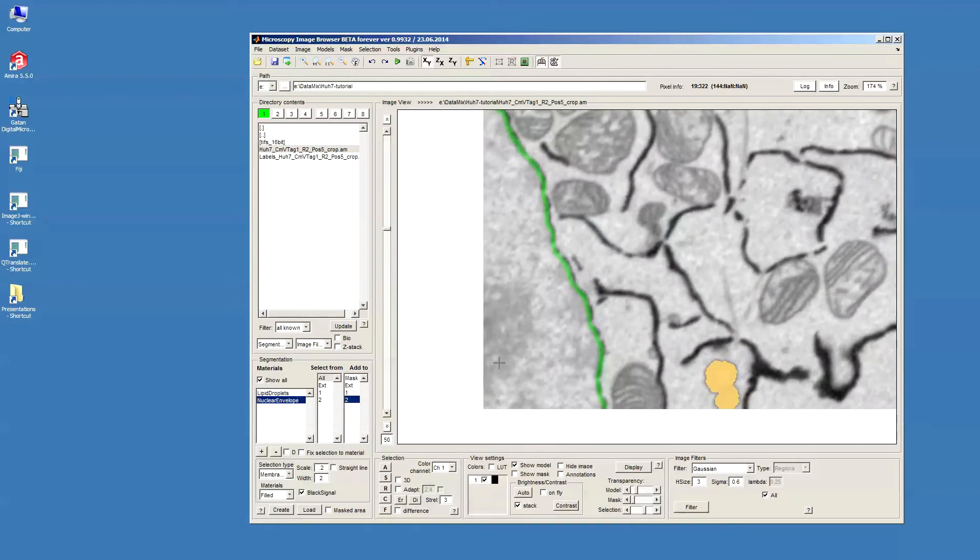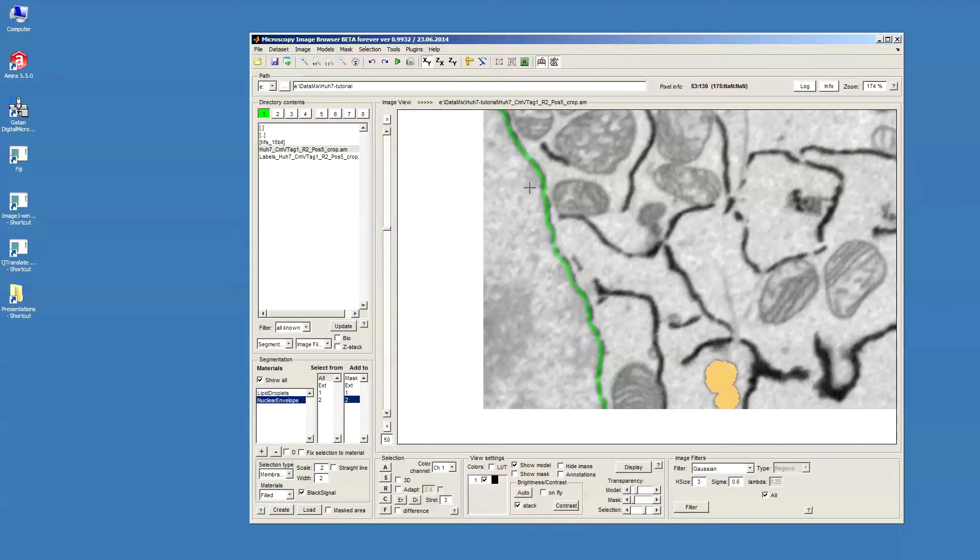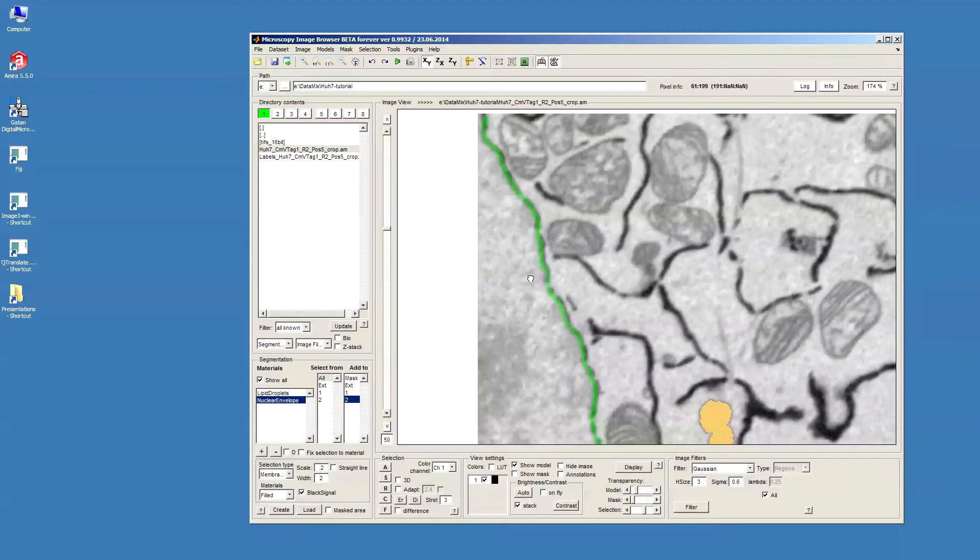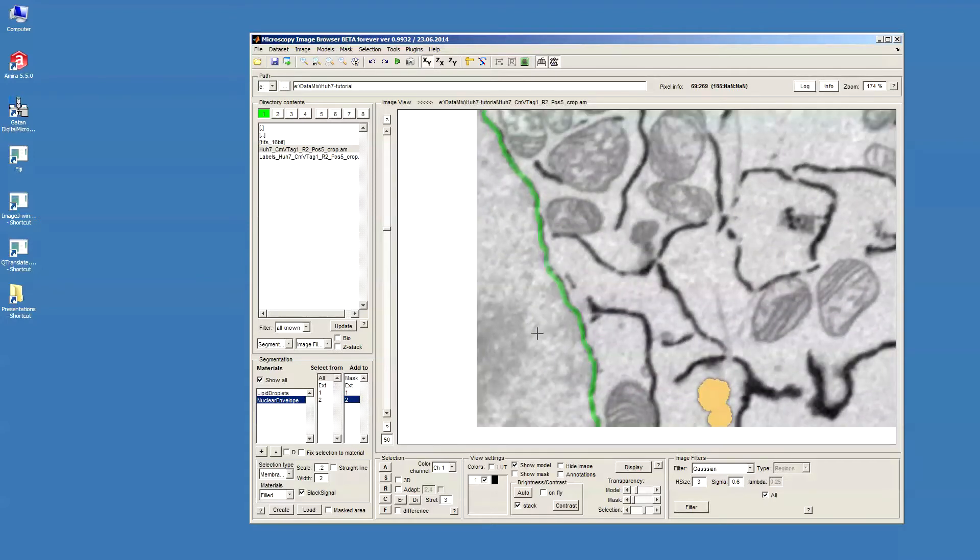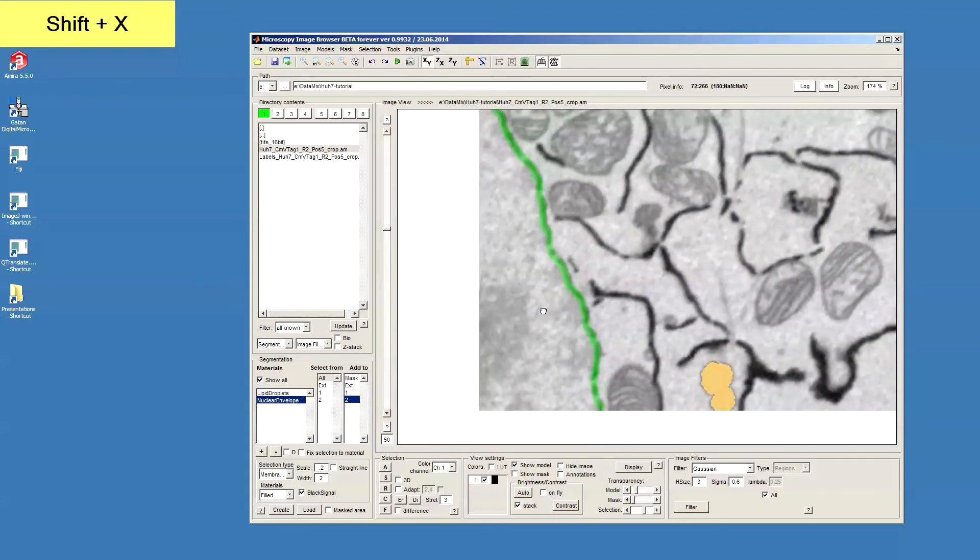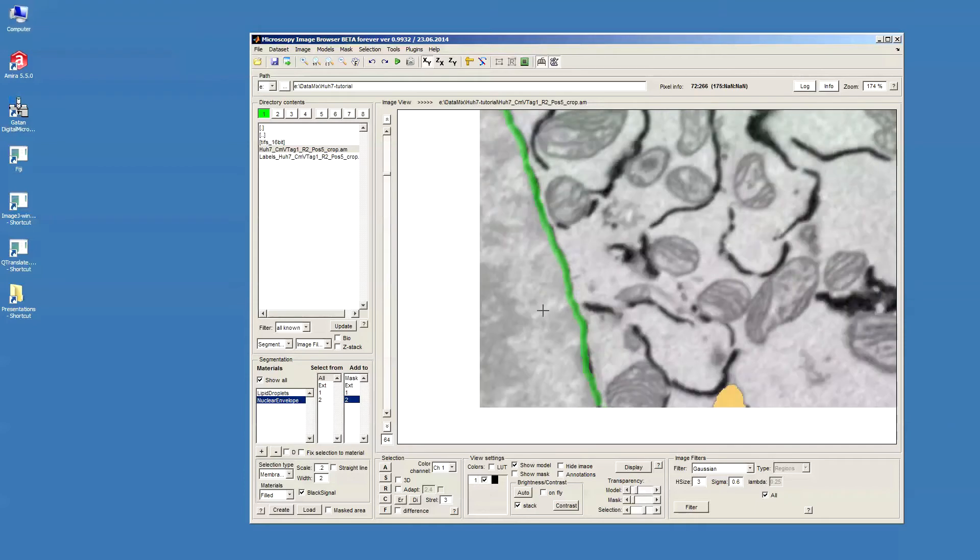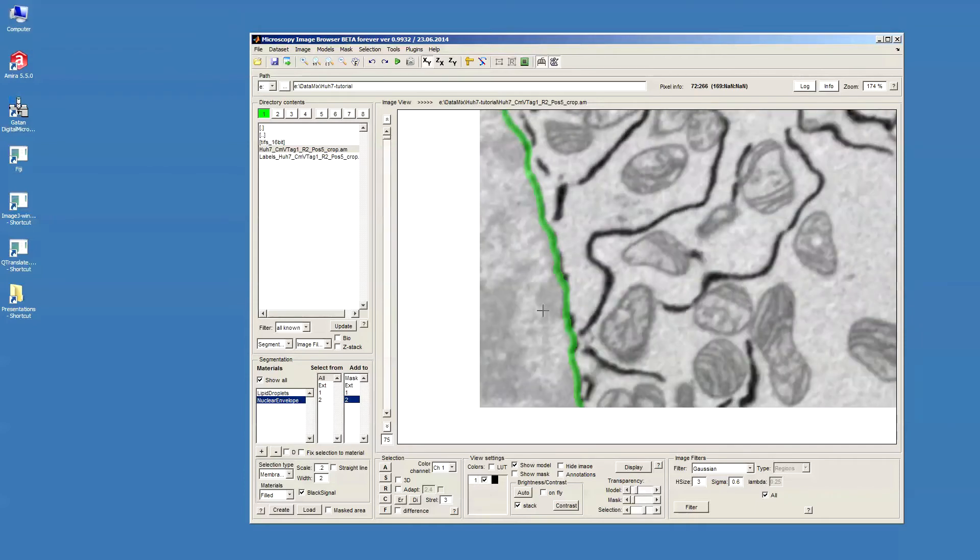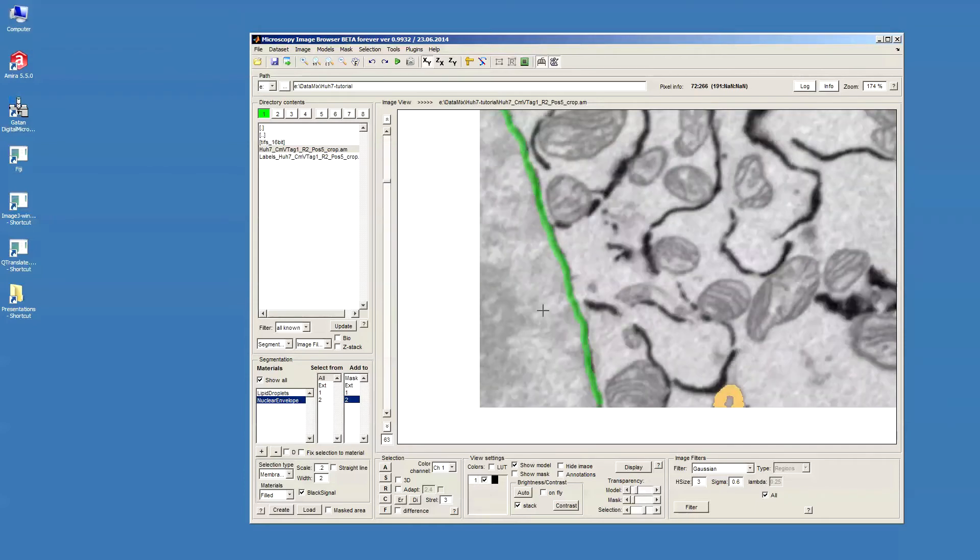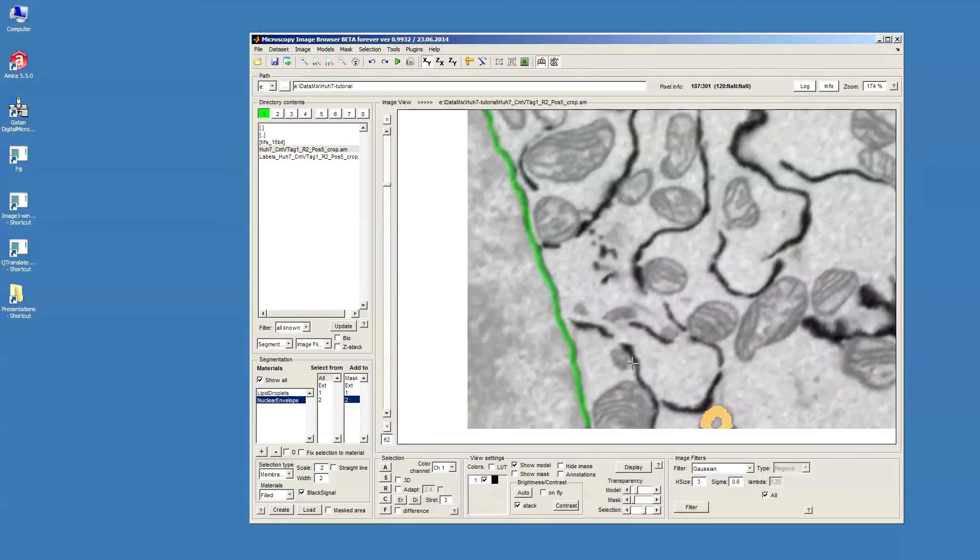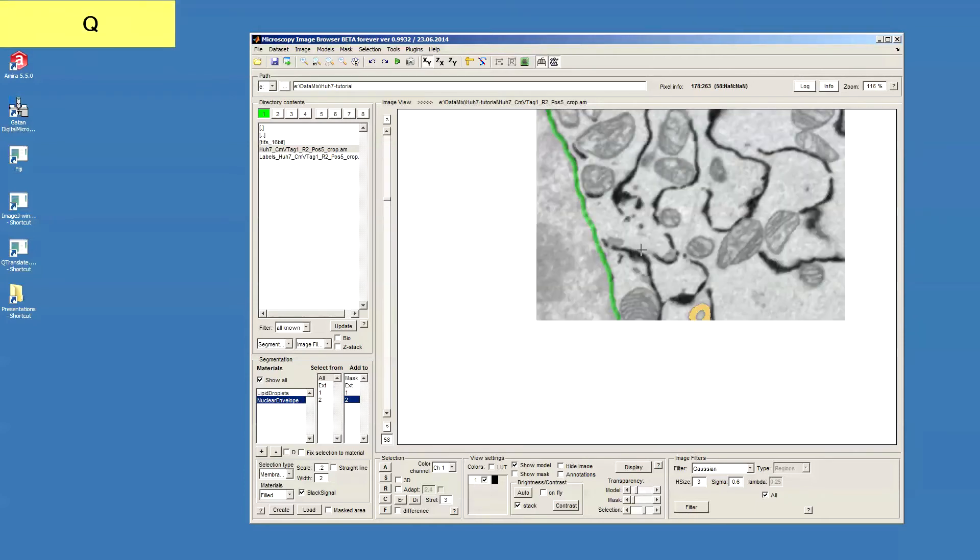What happens now, that the width of this membrane was increased by 3 pixels. And we'll probably do it once more. And then we can see that the membrane, the nuclear envelope is pretty good.